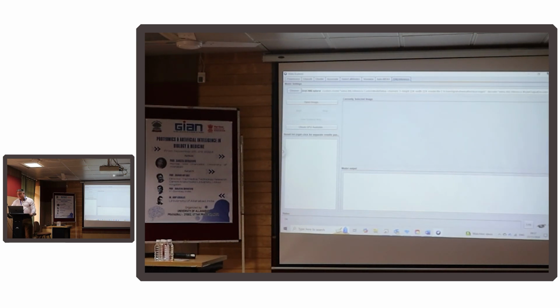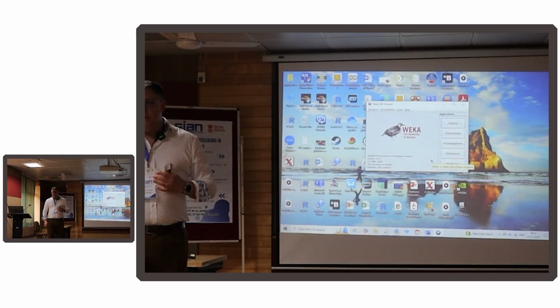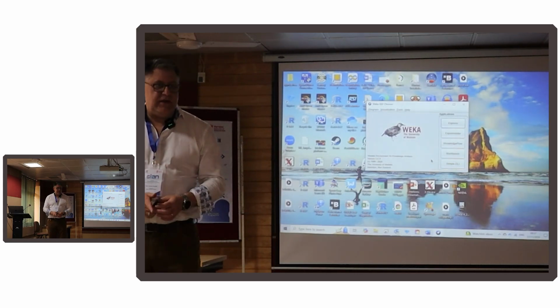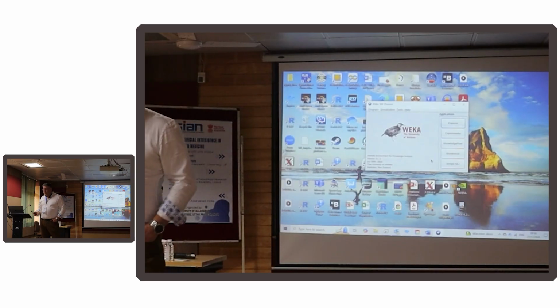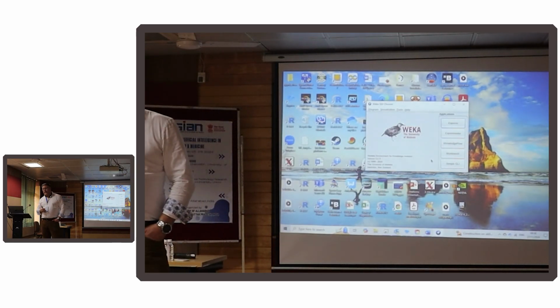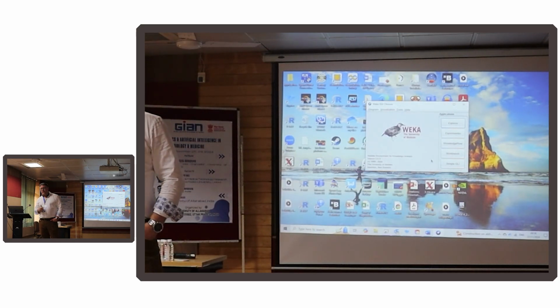So okay, that's the most simple interface for Weka. That's Explorer. I recommend you have a look at the videos, that you have a look at how to use it. You have a lot of help, a lot of support. If you want to try something, you can just Google, how do I do this in Weka? And I'm sure there's probably a video for that, or some text for that.